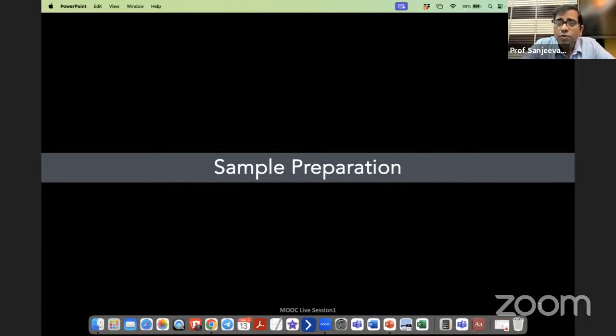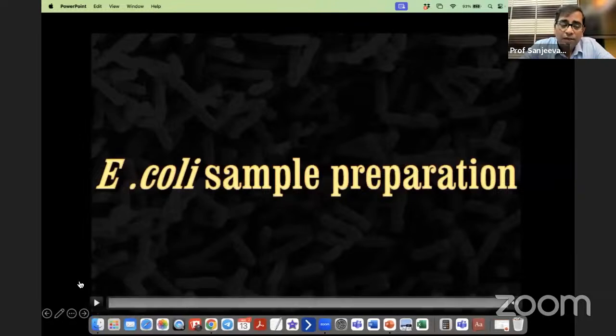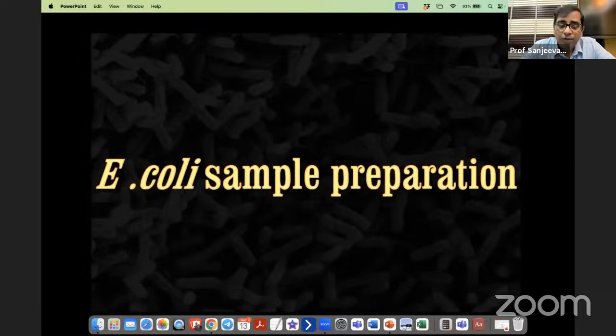In today's session, we will give you some live instrumentation from the lab, a few small clips. I will also introduce you to save time. But if we get more time, then we will show you more things from the lab. So let me start with the sample prep for E. coli, and that will help you understand a basic workflow for sample preparation.